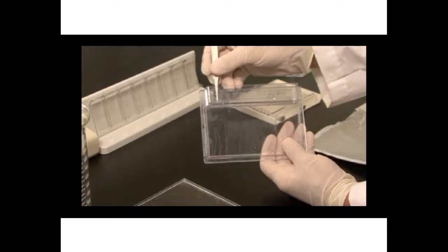In this case, I'm going to run the gel in the Criterion gel box, which holds 2 gels. In most cases, you're going to run multiple gels and you want to use a Criterion Dodeca Cell. Remove the gel cassette and place it into the Criterion cell. Load the upper buffer chamber with running buffer. Place the lid onto the Criterion cell.